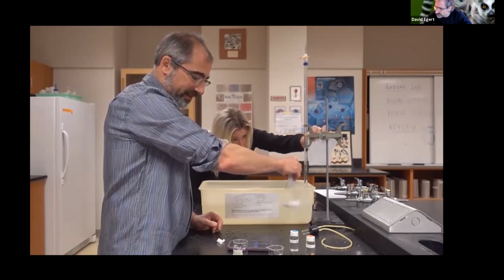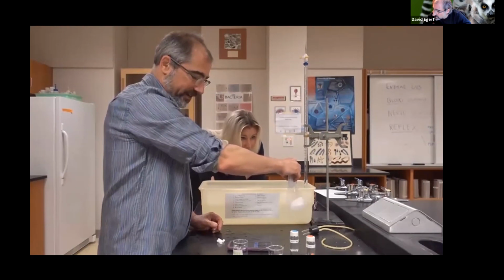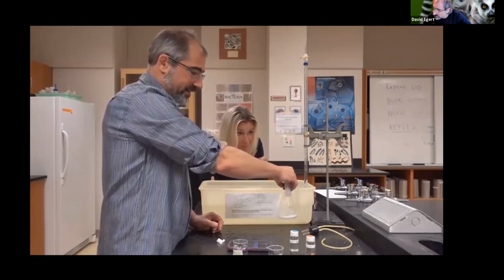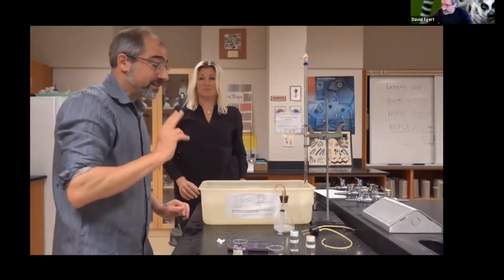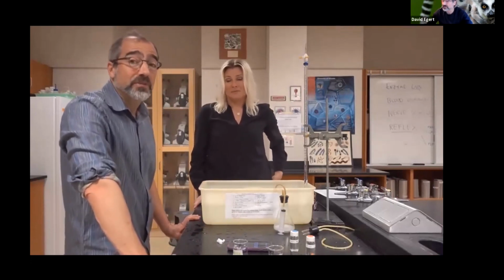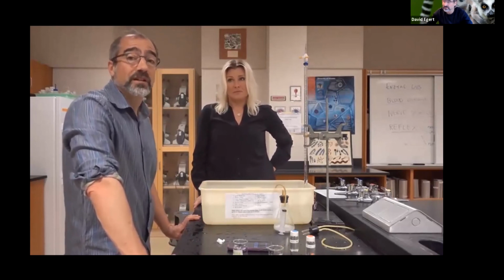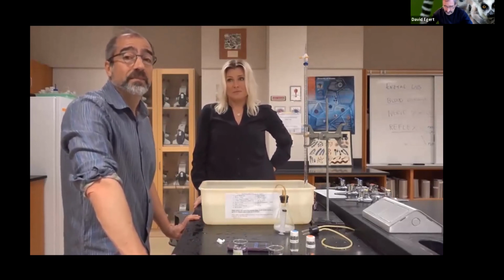Read. 21.9. Read. 21.9. So normally if you get the same reading 3 times in a row, that means the reaction has run its course, so there's no reason to keep taking data.